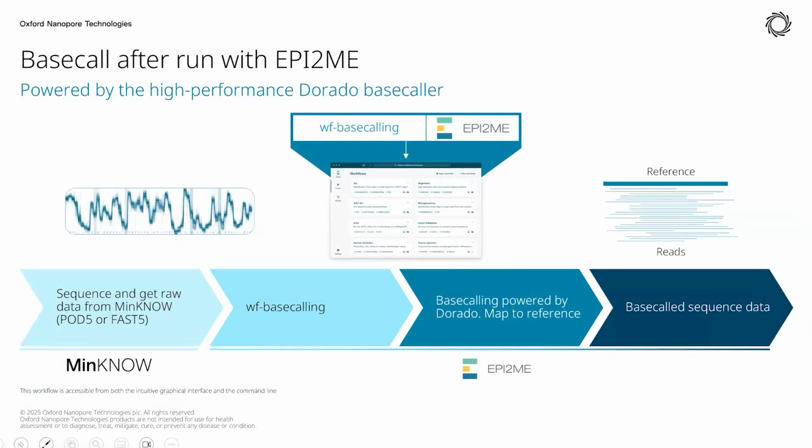Okay. Yeah, so our base calling workflow, as I mentioned before, is essentially a Nextflow wrapper around our Dorado software. Generally, I recommend just using the standalone Dorado software directly on your system rather than using this workflow. It tends to make it easier, and this workflow is always a little behind on the version of the Dorado software. So again, standalone is always going to be the more up-to-date option.